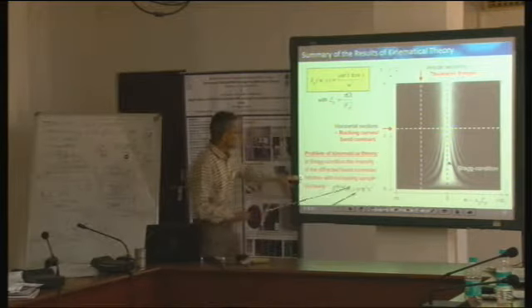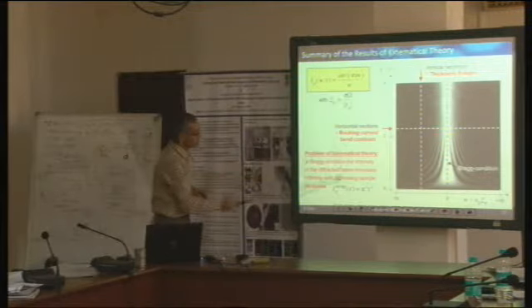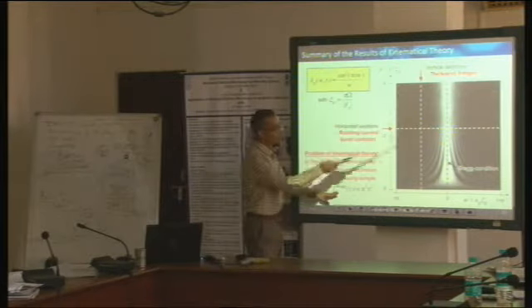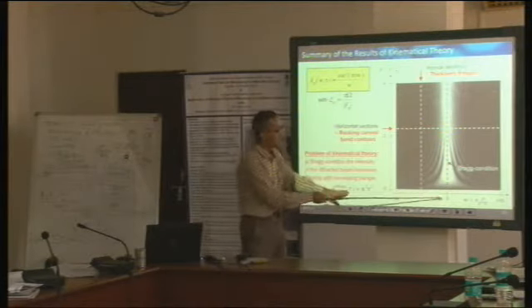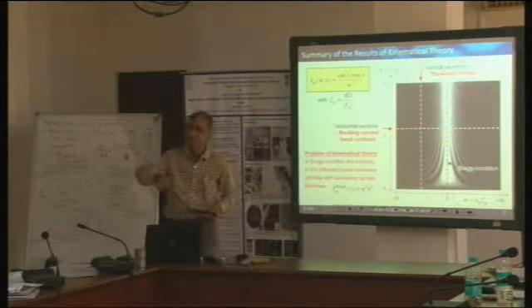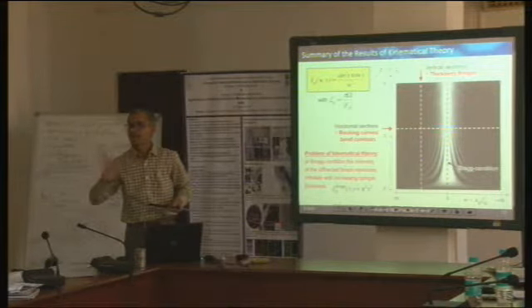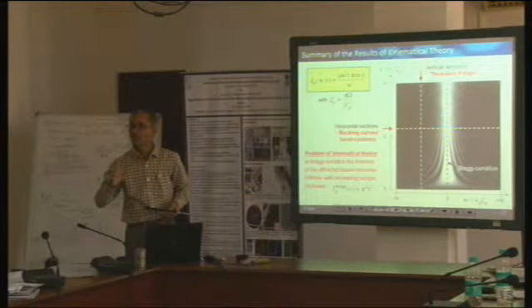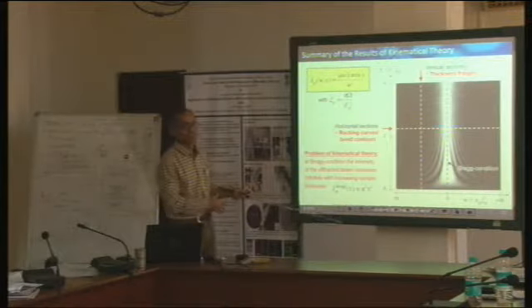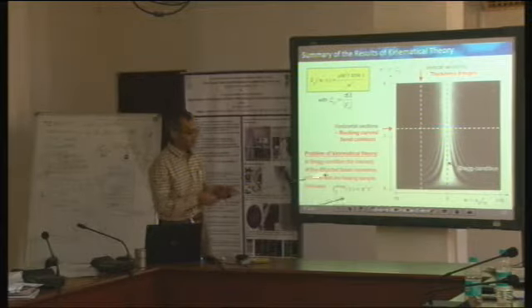What happens is when we make the excitation error equal to 0, then this becomes this, and which means that this equation, or this plot which is plotted here along this line, is precisely plotted along this line. It says that as we increase the thickness, intensity in my diffracted beam will keep on increasing. But this is not realistic. This is not what really happens, and therefore our kinematical scattering assumption fails. Yeah, so that's one thing.